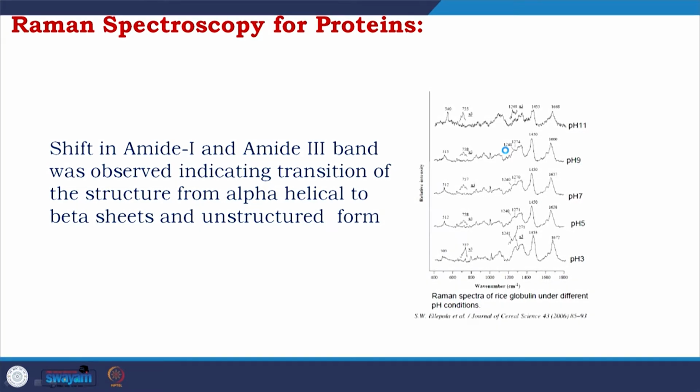I talked about those characteristic bands, the fingerprints are good, but in reality, the tendency or frequency of people to study protein using Raman spectra is really less.